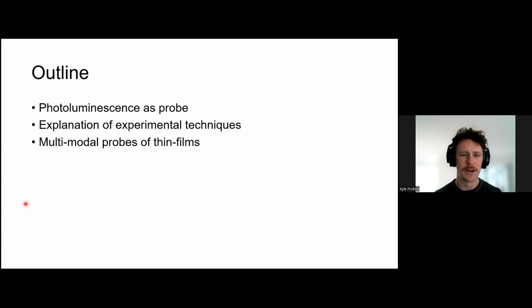I will talk about these multimodal probes that we put together, where we combine several different microscopy techniques, each with a different contrast mechanism, and point them all at the same area and try to develop a correlative understanding of relationships between the structure and the chemistry and then the optoelectronic performance of a material.